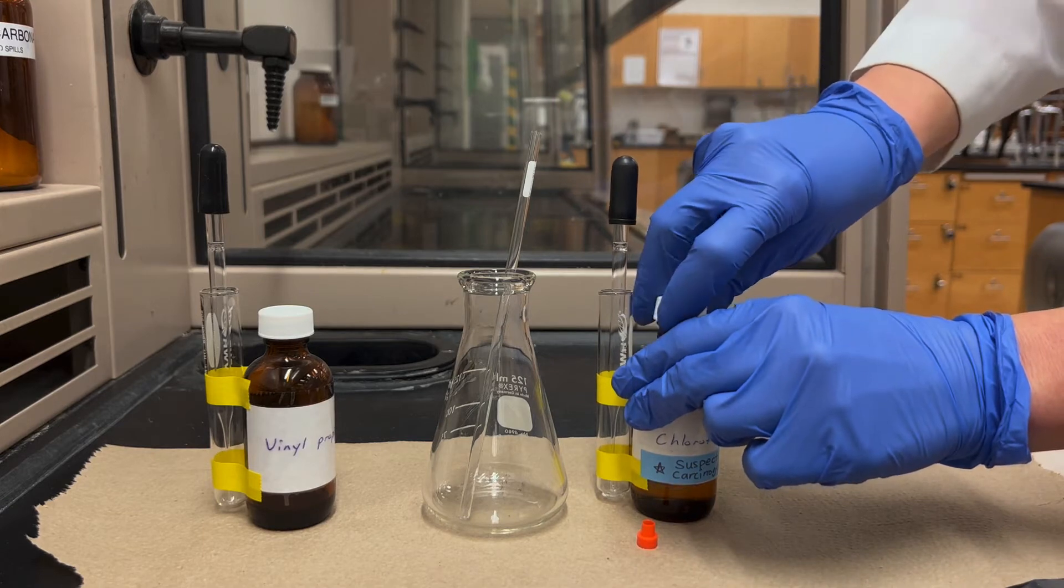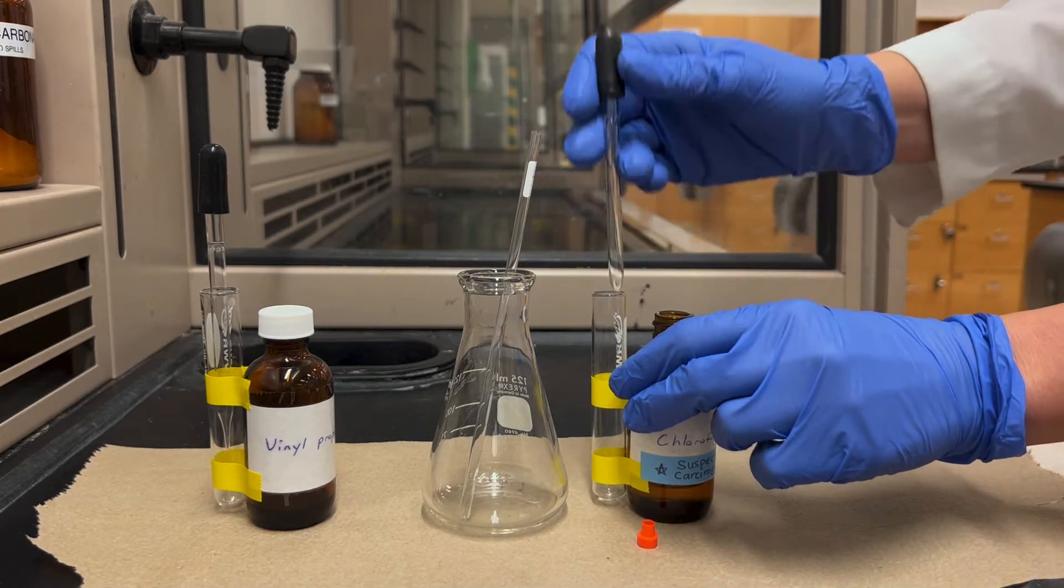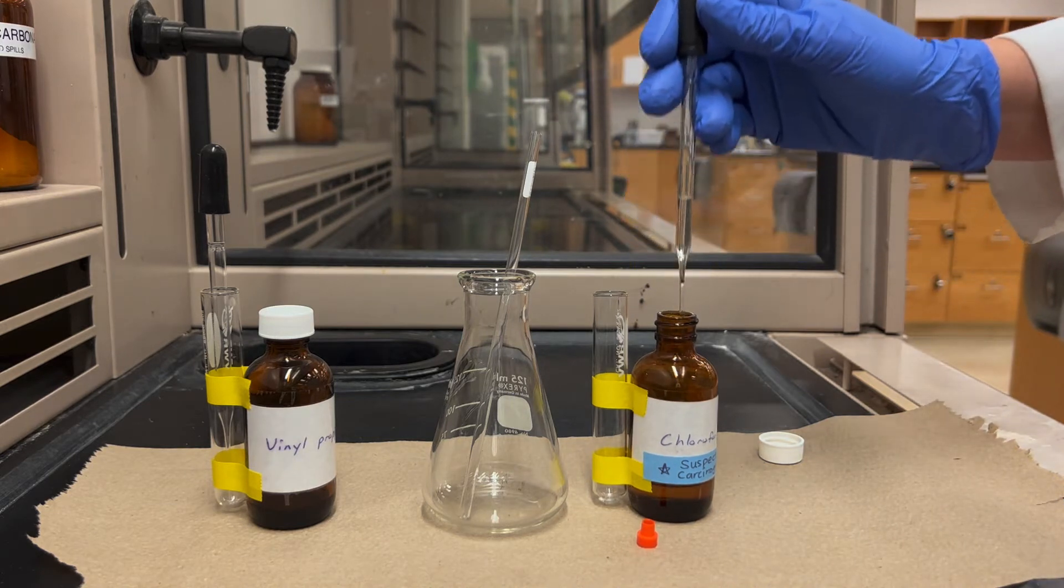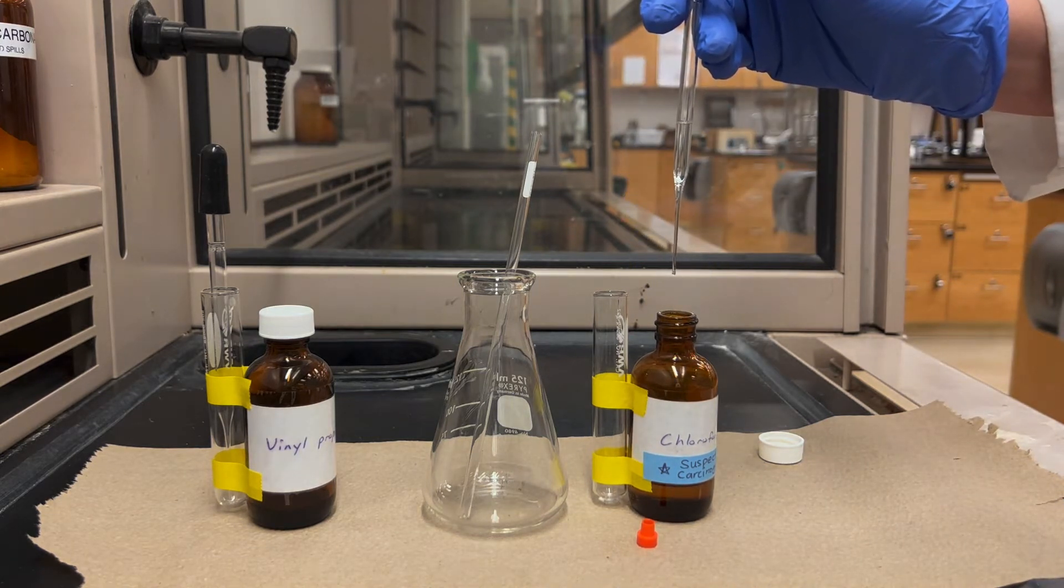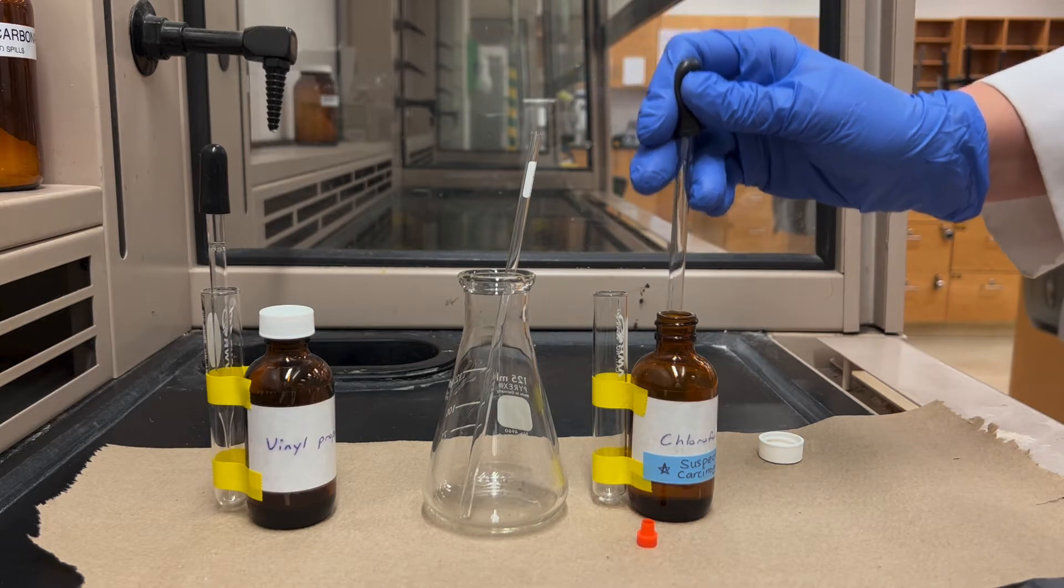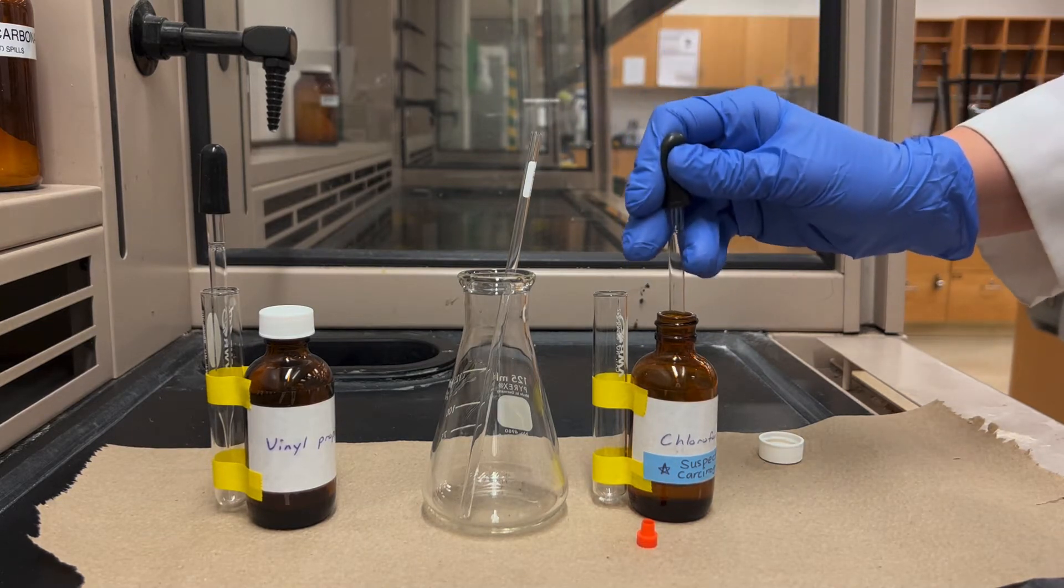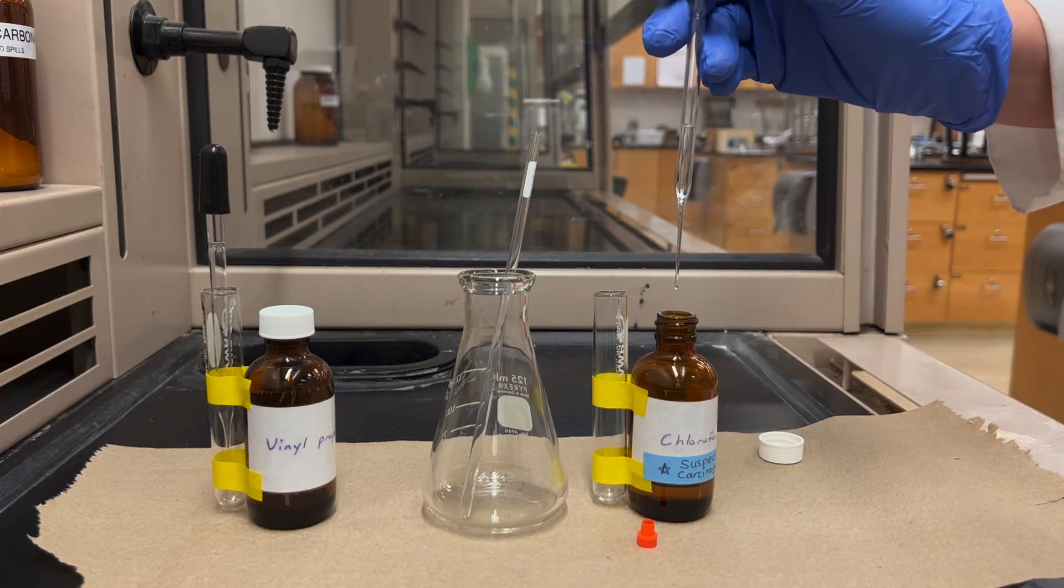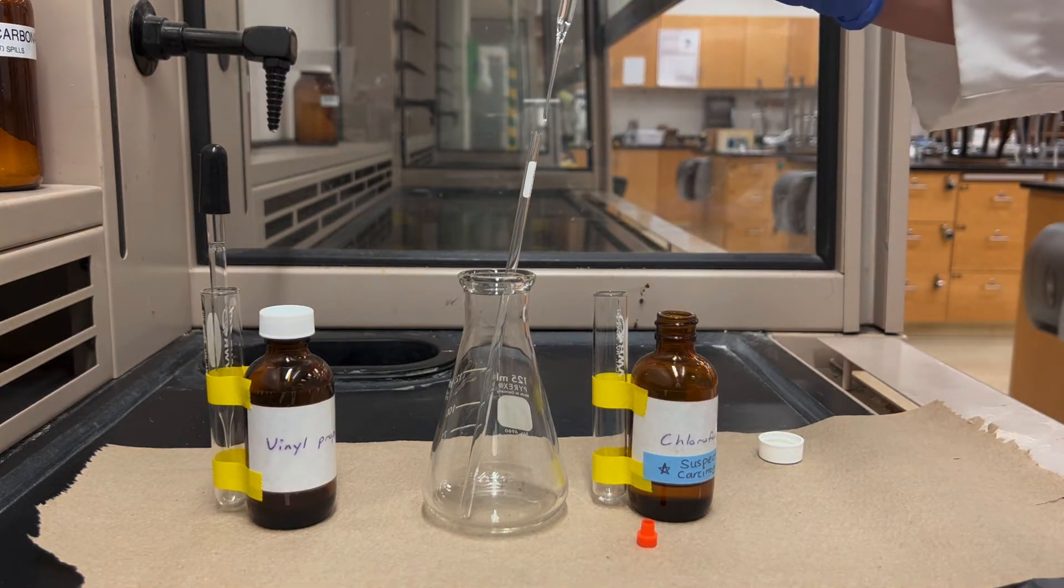Deuterochloroform also has a tendency to drip out of the pipette, so if you pull up some liquid and then notice that it's dripping out of the pipette all on its own even without pushing on the bulb, one way to fix this is to withdraw and expunge the solvent a few times. By doing that you'll saturate the headspace in the pipette with vapors and it won't drip anymore.